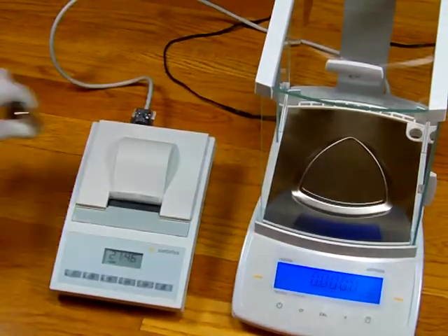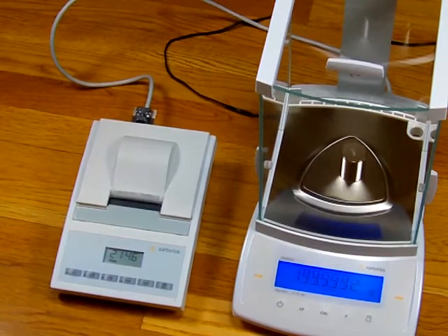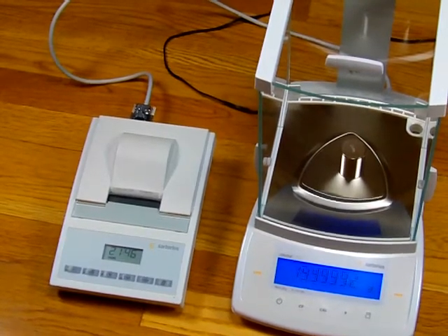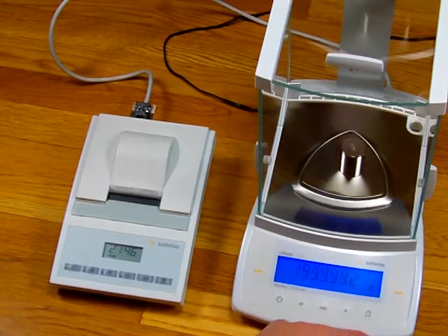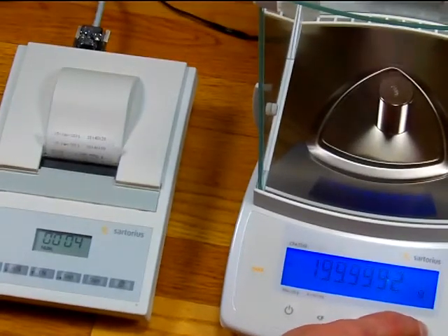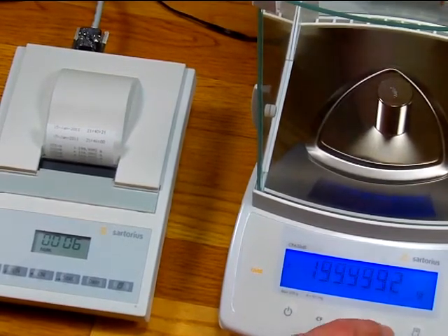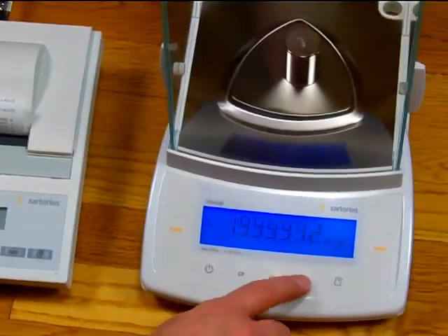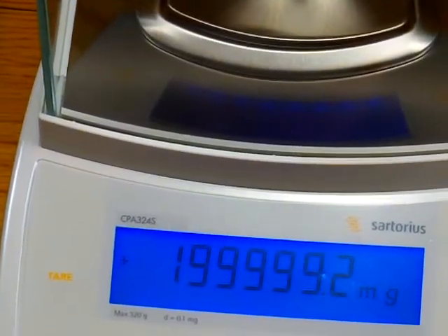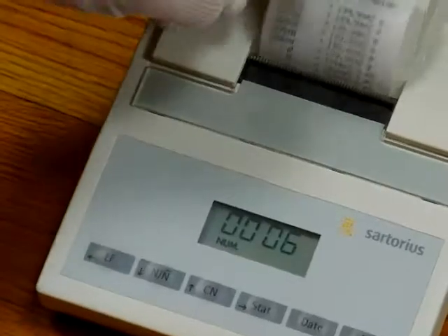We'll put our 200-gram weight on the balance. When we move the balance around we're supposed to re-level the feet each time, which is why you may see a slight difference in the weight reading. The key point is that by pressing the print key, we can transfer that data to our printer. We can also toggle between a second weight mode — this balance is configured for milligrams. Notice how the display changes: we have grams here, press the F key, and now we have milligrams. You can send the data by pressing the print key.